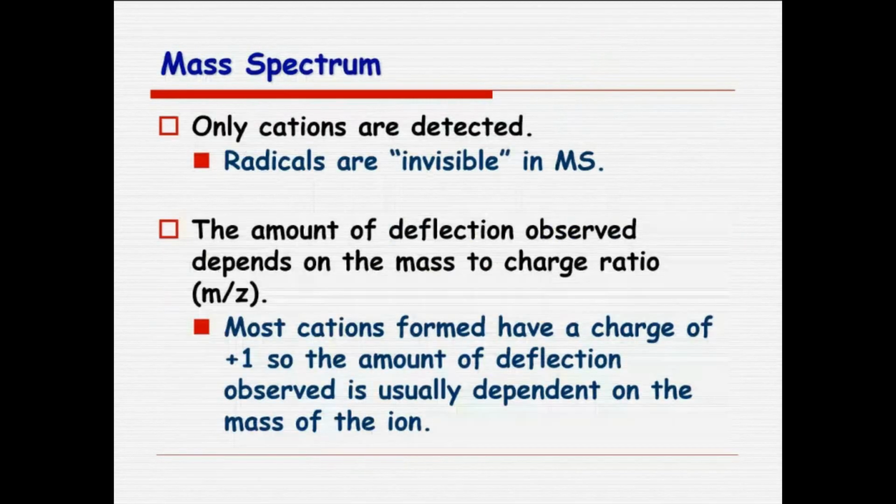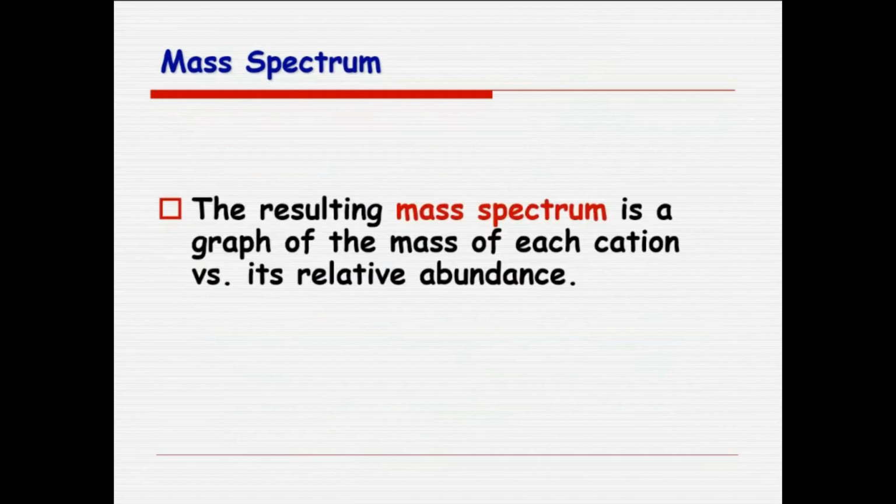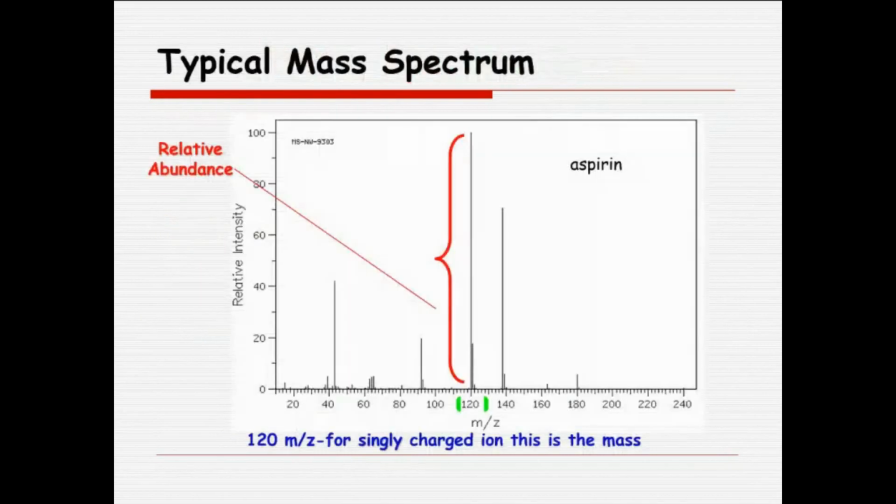Generally you just have to cut the molecule. And you have something known as the base peak. The highest mass peak becomes your molecular ion, and when you break the molecule, you'll surely have peaks lesser than the molecular ion. Among those, the peak with the highest intensity is the base peak.